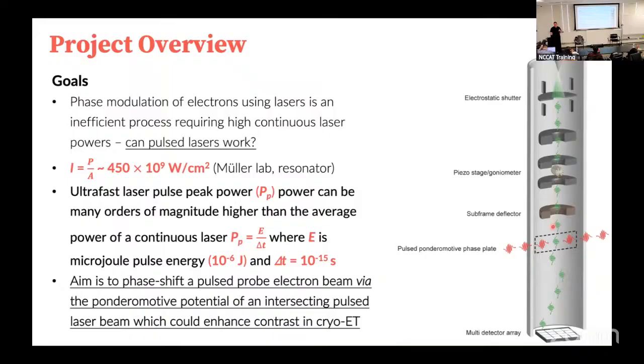The advantage of doing this pulsed electron emission is that you can then interfere that with pulsed photons. So effectively, you can time a sort of laser to be pulsed rather than continuous. In Holger's case, this is basically a continuous laser. So the same thing applies: there's no timing applied to it. The photons are just coming out at random.